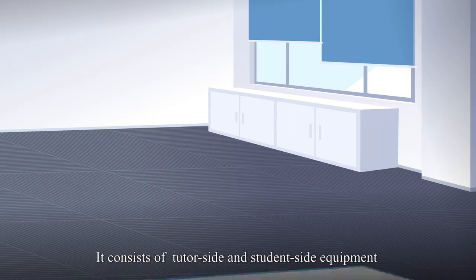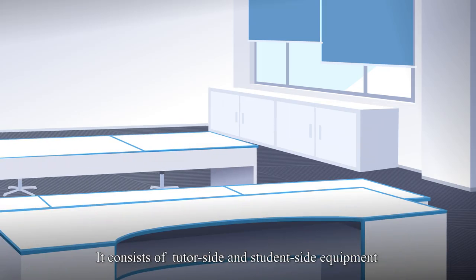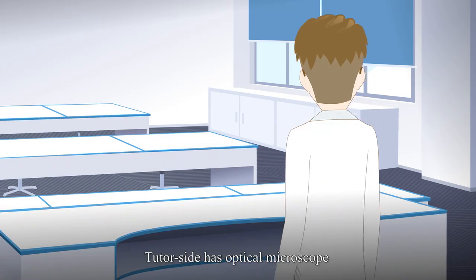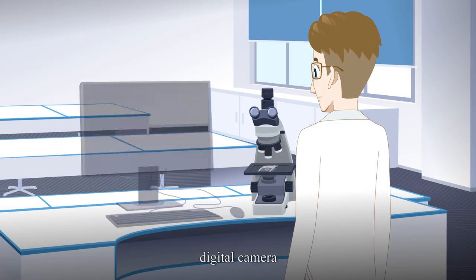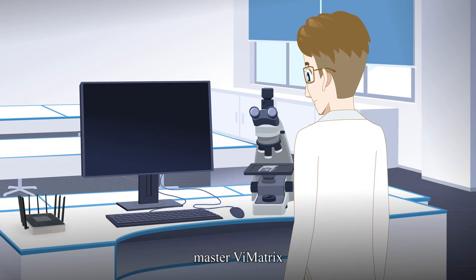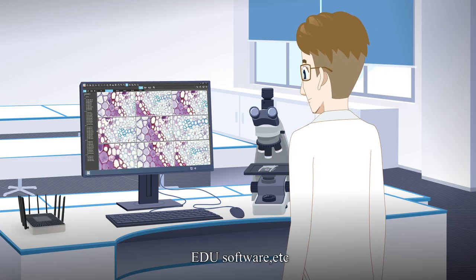It consists of TutorSide and StudentSide equipment. TutorSide has optical microscope, digital camera, PC, Master Vimatrix, EDU software, etc.